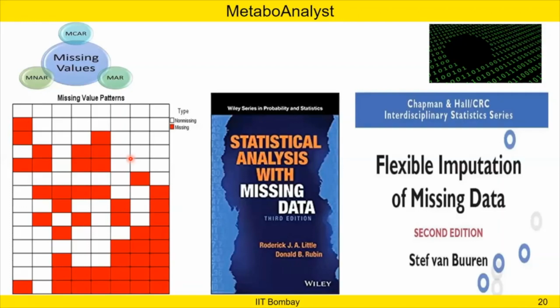And why is this happening? This can happen due to many reasons. For example, in sample processing, this particular sample has not been processed well, or while transporting the sample from your hospital to your lab, the sample might have gone bad or not been stored properly. That could be the reason this sample has so many missing values. So as I discussed, MNAR, or missing not at random, should be taken very seriously and should not be ignored, right?